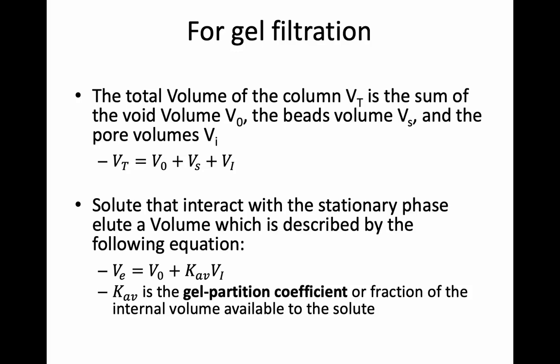If we define the total volume of your column as the sum of the void volume, the volume of the beads, and the volume in the pores inside the beads, people have determined that the elution volume of a certain analyte can be computed as the sum of the void volume and the product between the so-called gel partition coefficient and the pore volume, the volume of the pores, right?